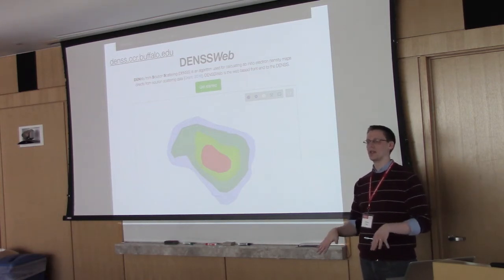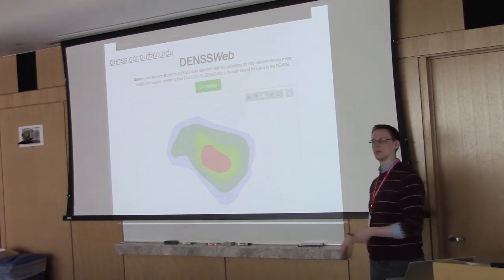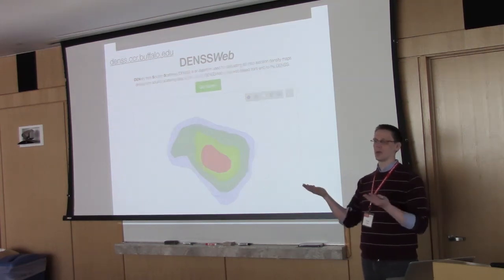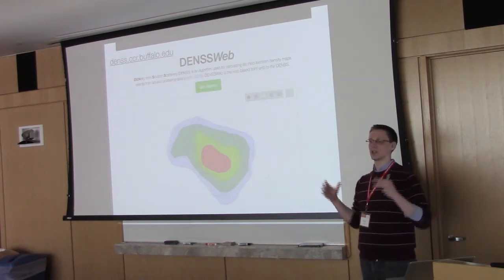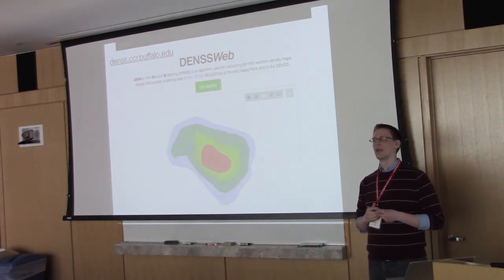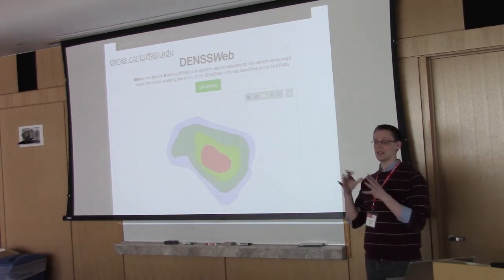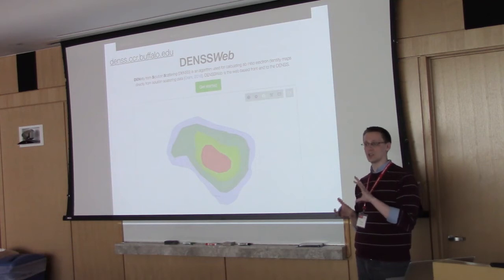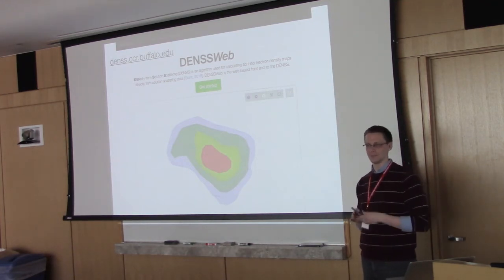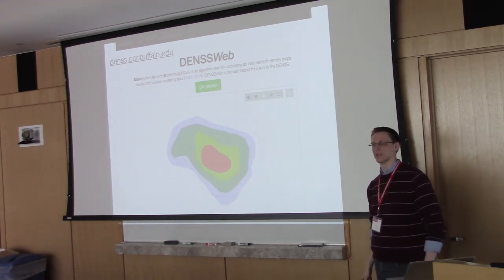Everything below 20% in the blurred map will get told to be solvent, that's sort of outside the support, and everything above 20% is inside the support. And it does this gradually. When it starts, for the first, I don't know, 5,000 steps or something, it's not using any support at all. There's no solvent flattening. It's just positivity. And that gets pretty close to what the final answer should be. Then the solvent flattening gets engaged, and it just kind of cleans it up. So the solvent flattening at this stage is really just cleaning up the noise.